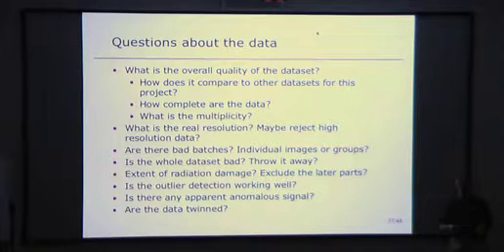Find out what the real resolution is. Very often you will see from scaled and merged data that you have a higher resolution data than you can actually see spots on your diffraction images. Alternatively, you may be trying to process to too high resolution and have no information in the high resolution regions, so maybe cut back the processing to lower resolution.